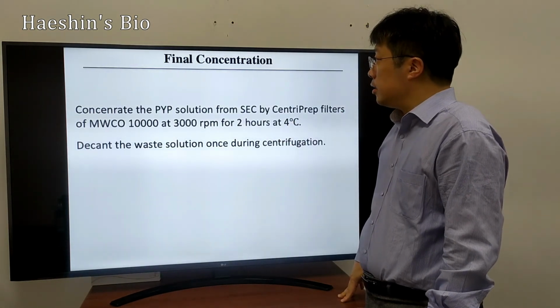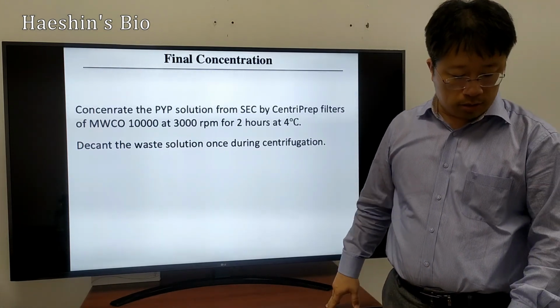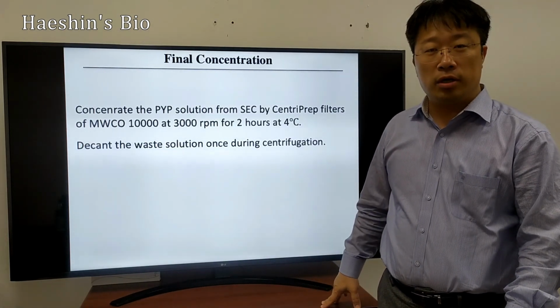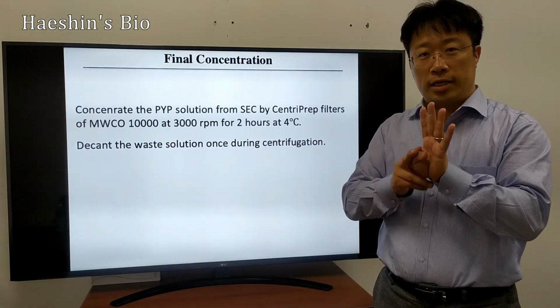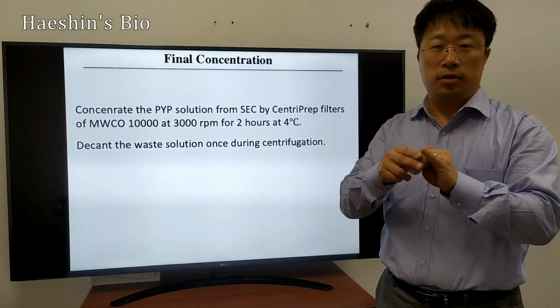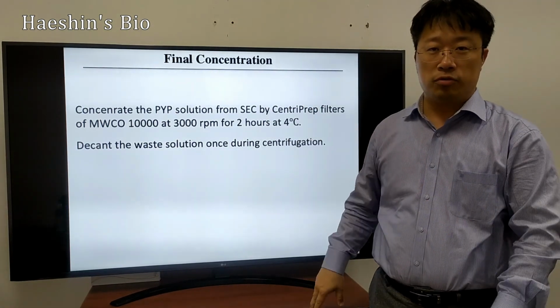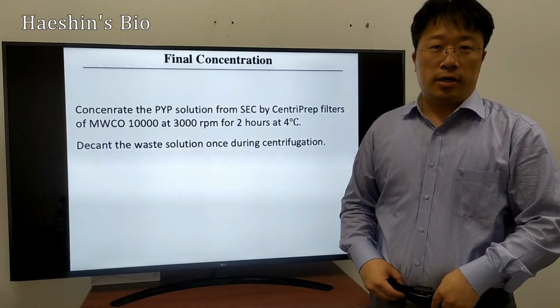So this is the final concentration, and this is the actual case study of how we apply the systems we learned about, size, charge, affinity, and salt. We combine all of them together and purify this protein from E. coli. Okay, thank you very much.